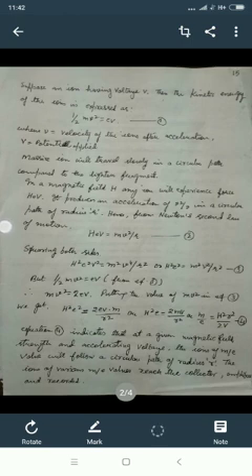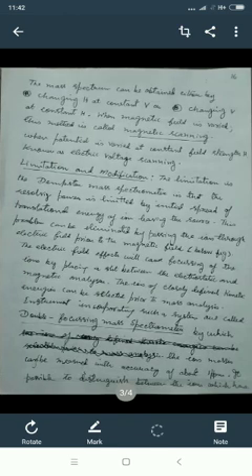This equation number 4 indicates that at a given magnetic field strength and accelerating voltage, the ions of a given m/e value will follow a circular path of radius r. The ions of various m/e values reach the collector, amplifier, and are then recorded. The mass spectrum can be obtained either by changing H at constant V or by changing V at constant H. When the magnetic field is varied, the method is called magnetic scanning. When the potential is varied at constant field strength H, it is known as electric voltage scanning.